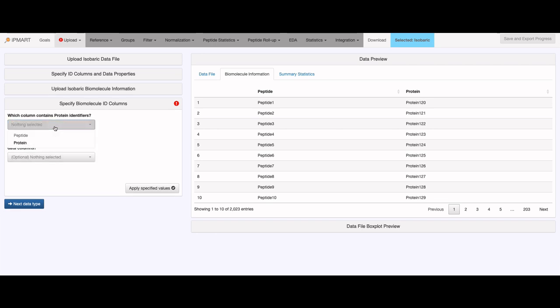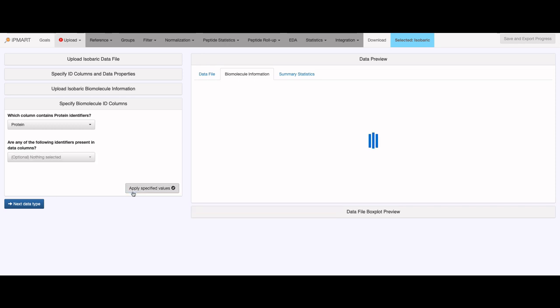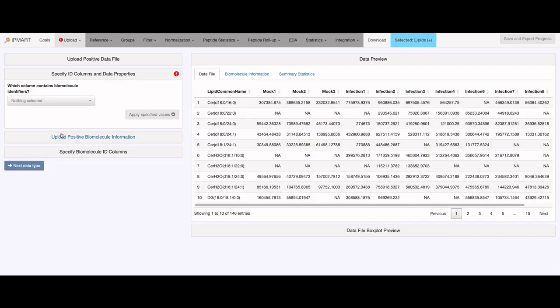For more details, see the Upload PMART video. The link is in the video description. After completing each dataset, click Next Data Type to progress.